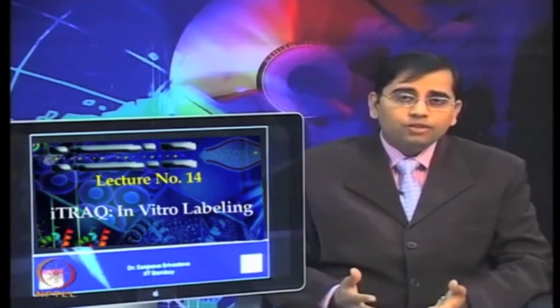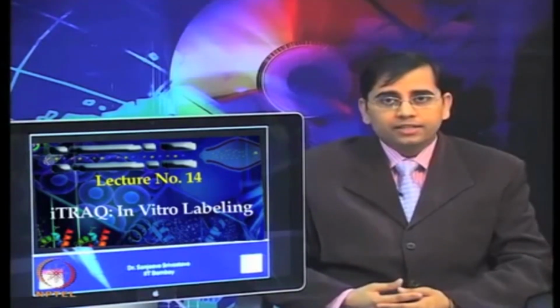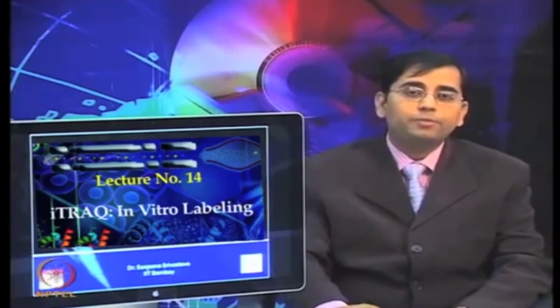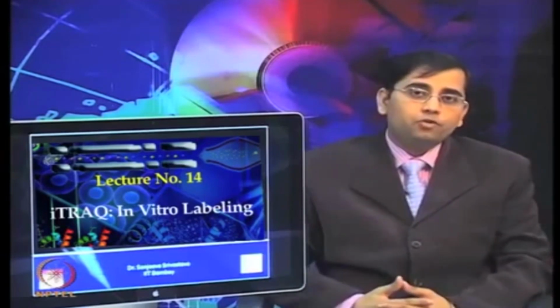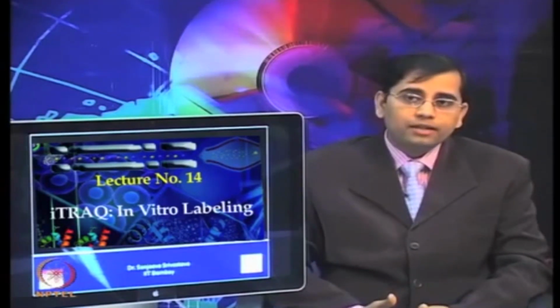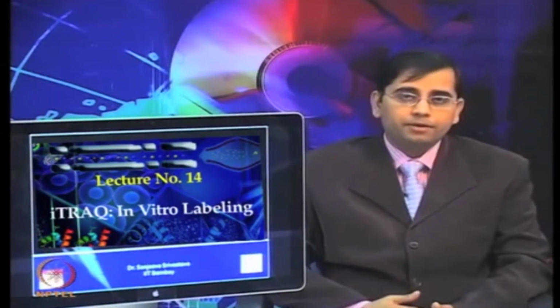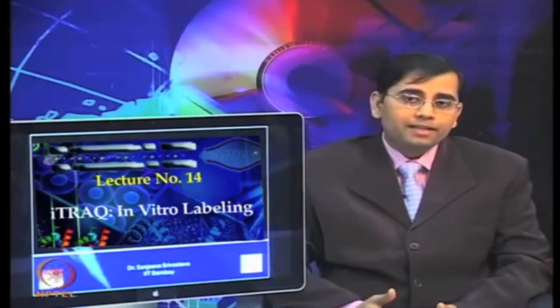ICAT was the first quantitative MS based approach, but because only two samples could be analyzed, new approaches came considering sample multiplexing. One limitation of ICAT was that only two labels are available. Therefore, more samples cannot be compared in a given experiment. So, there is a need to compare a large number of treatments.